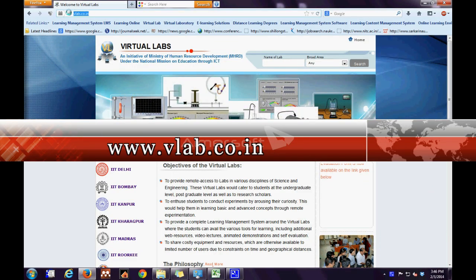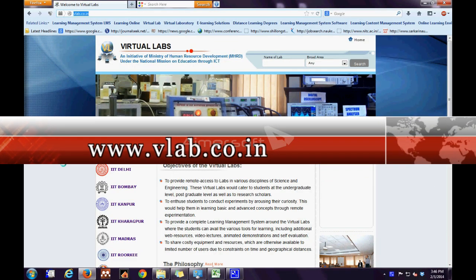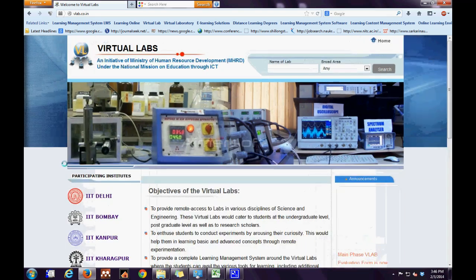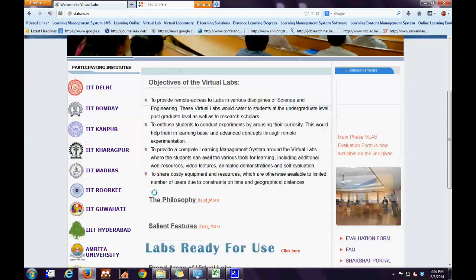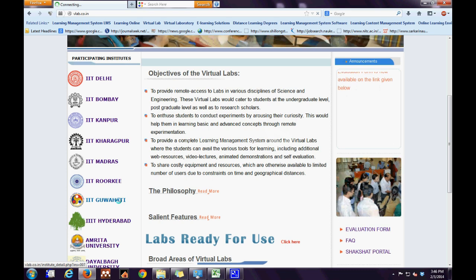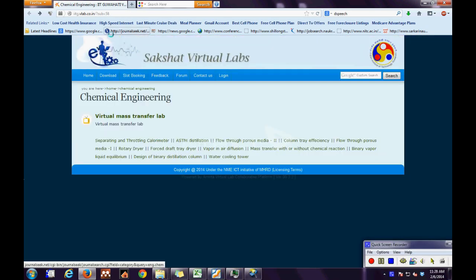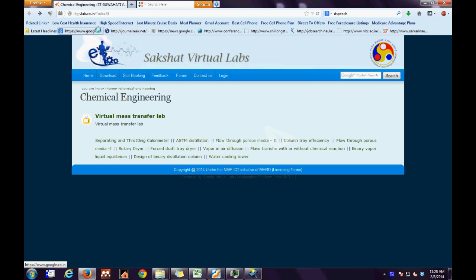The first step is to log on to vlab.co.in. The second step is to click the link IIT Guwahati on the extreme left. The third step is to click the link virtual lab for mass transfer. The fourth step is to click the link for ASTM distillation, which takes us directly to the online portal.